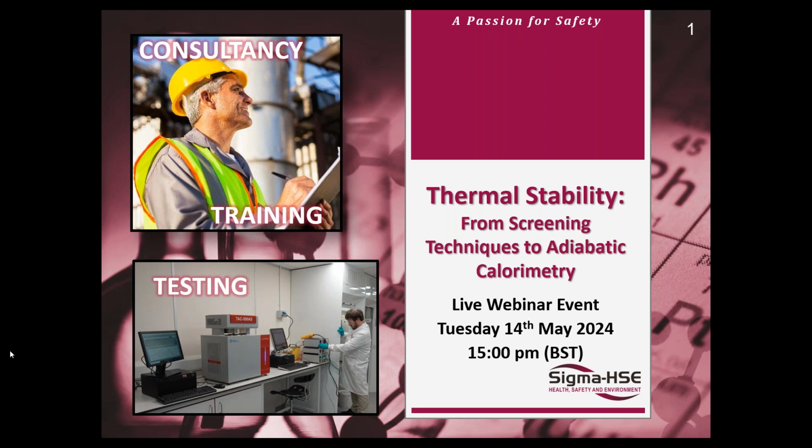The webinar today, we're going to cover all things thermal stability in regards to chemical reaction hazards, from the quick and easy indicative screening tests through to more advanced adiabatic calorimetry tests. Some of the later techniques or equipment we'll be using are very adaptable, but we'll try and focus particularly on thermal stability and how it fits into your process safety design for your chemical reactions.